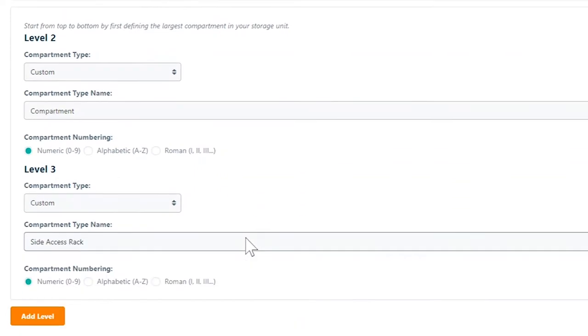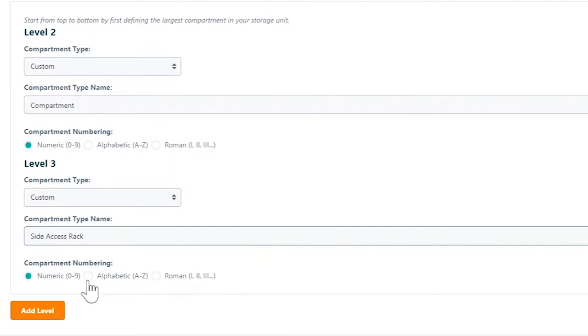Specify the compartment numbering with numeric, alphabetic or Roman symbols.